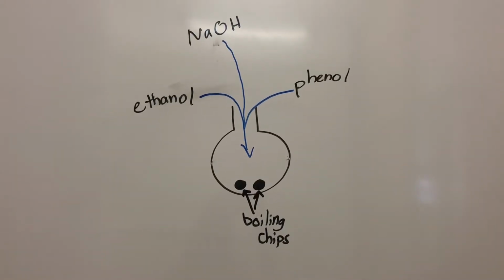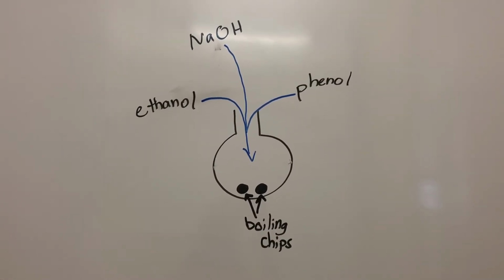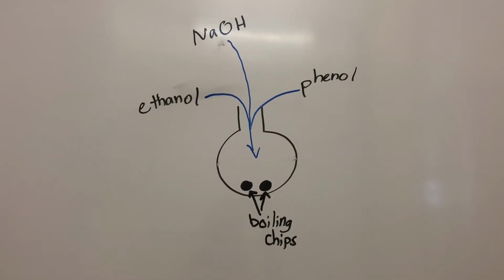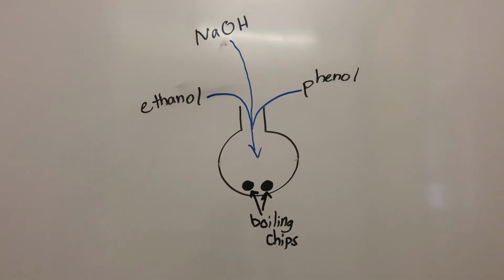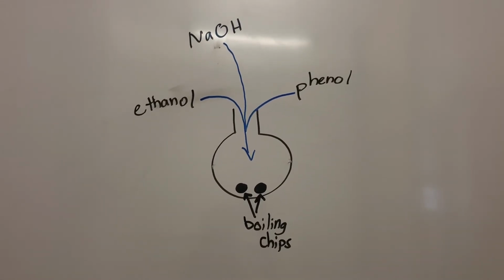When we do this reaction, we will first want to carefully weigh our reactants on a tared scale, being sure to record to 3 decimal places. We will then place them all in the 50 to 100 milliliter round bottom flask. Our reactants consist of the phenol, ethanol, and the sodium hydroxide in the reaction vessel. And we can't forget the boiling chips.